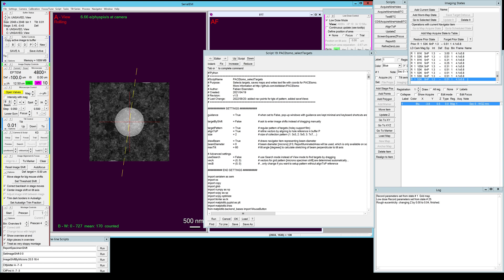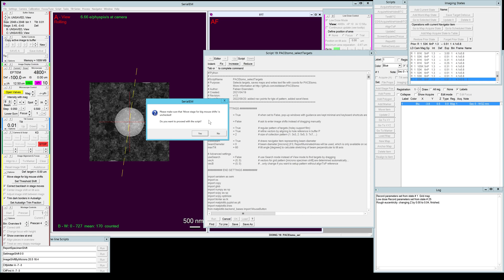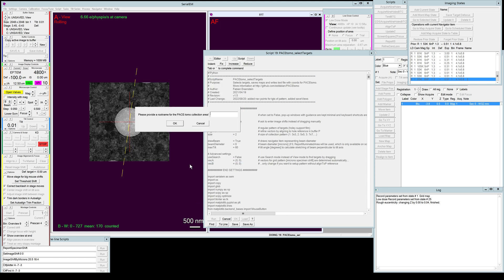Then we're gonna run our select targets script. Once again it reminds you to check the move stage for big mouse shifts or to uncheck it which we have done. We choose the folder where all the tilt series and target pictures and associated files are saved and we're gonna give it a name so I'm just gonna call this five by five pattern.